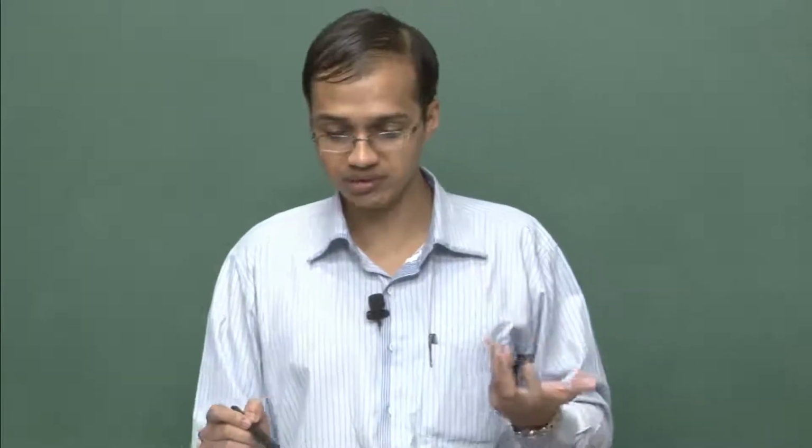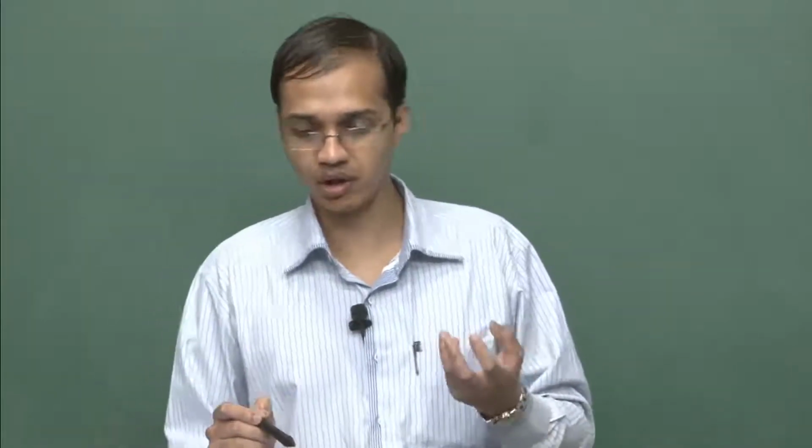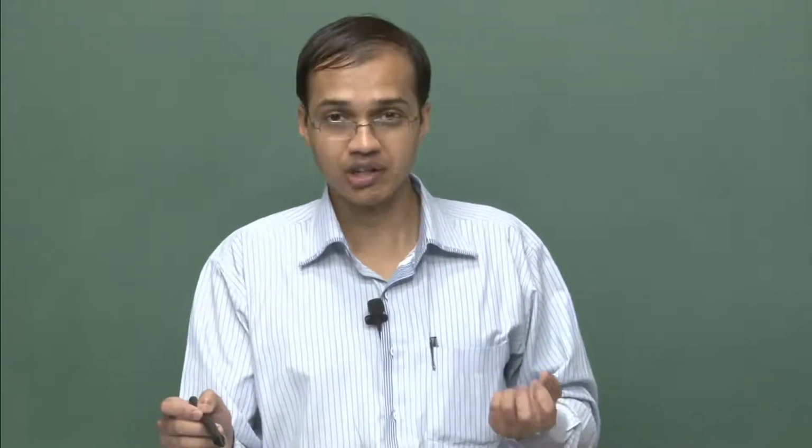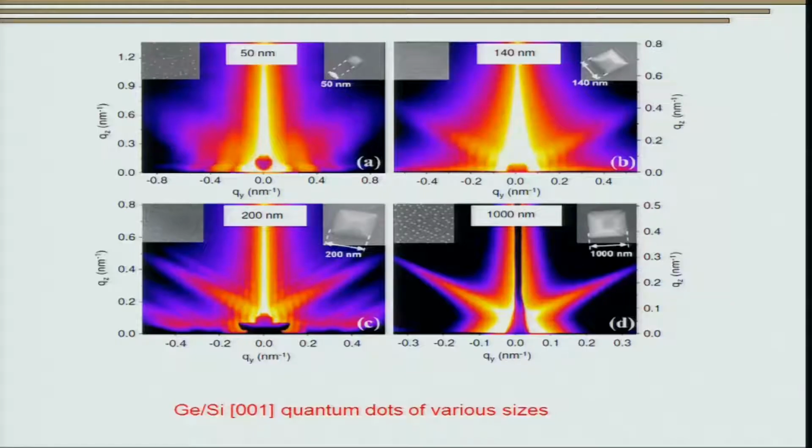Now, I would like to emphasize that for carrying out SEM and all, it is very difficult. You cannot do it in situ; we have to stop at each and every stage and then do the sample. However, grazing incidence small angle X-ray scattering probably offers the only technique wherein you can monitor the growth of particles, or catalysis or chemical reactions occurring at the surface, in situ, right. So, this is the only technique that gives you real in situ information.